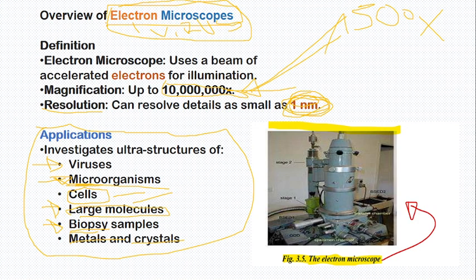It is very important because, for very small objects, you can use electron microscopy to see them. I hope this is the image. I'm not going to teach you the parts of it, but even in your syllabus it is going to look like this. Just understand that it is big like this. Okay, it's like a tank.